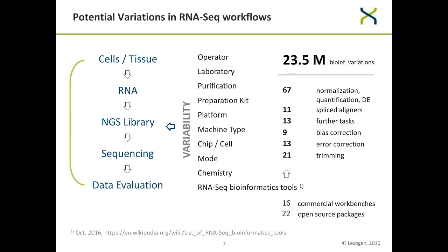And even if you do not explore all of these variations, just think about the possibility that you now evaluate your transcript with, let's say, TopHat, and then in 1 year you change to TopHat 2, and that's a version upgrade that affects the quantification, and you should be able to control for it.